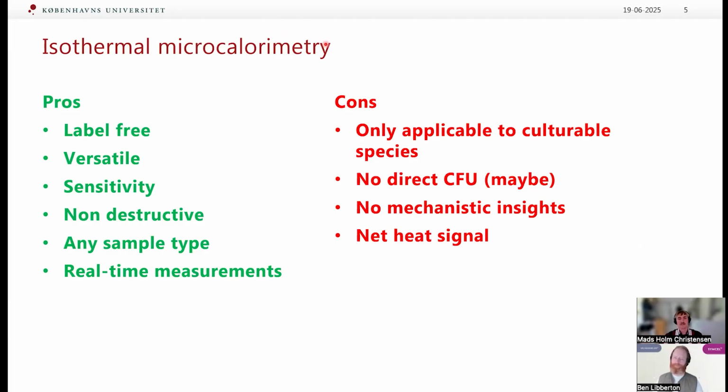So you don't have to wait necessarily 24 hours, 18 hours, or 48 hours until you have a reasonable result that you can use. So as I mentioned, it is still basically culture-based since you grow your bacteria inside the system. So species that cannot be cultured in the lab can also not be detected in this setup. And of course, you don't get any mechanistic or genetic insights into the resistance patterns of the pathogen.